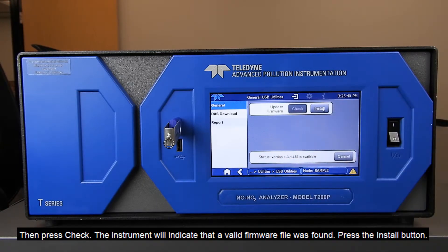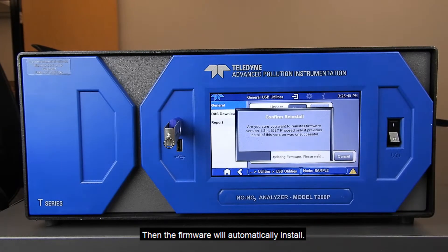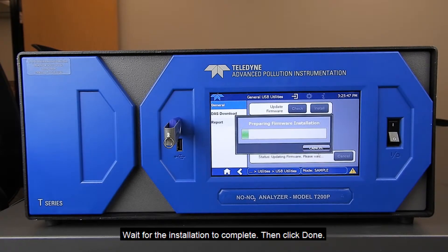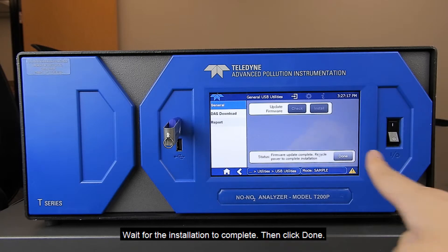Press the Install button. The firmware will automatically install. Wait for the installation to complete, then click Done.